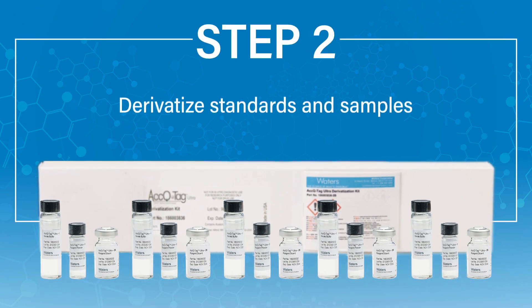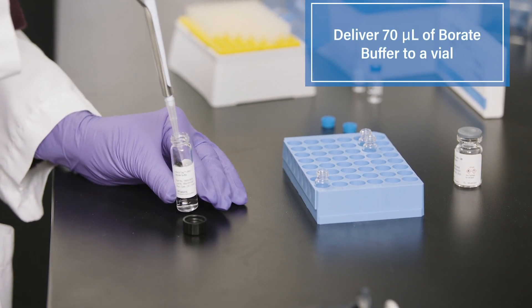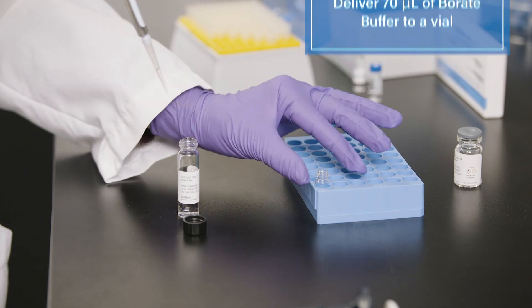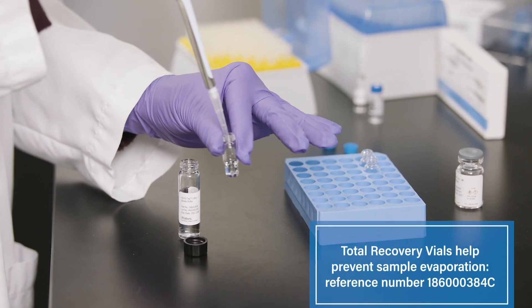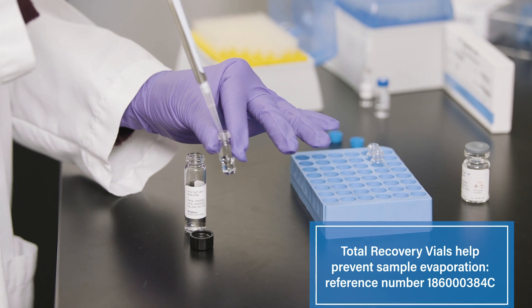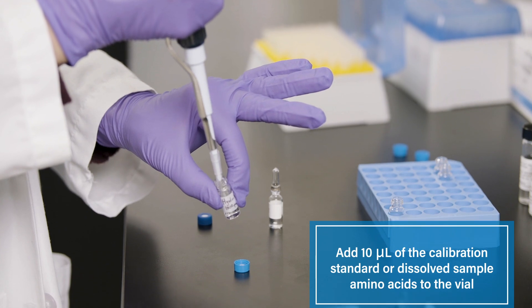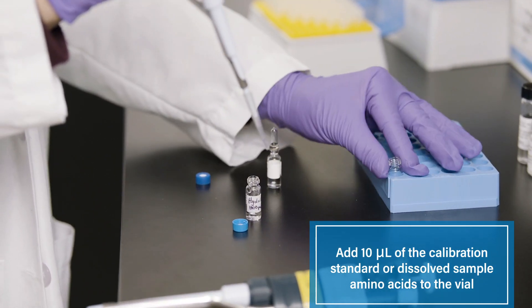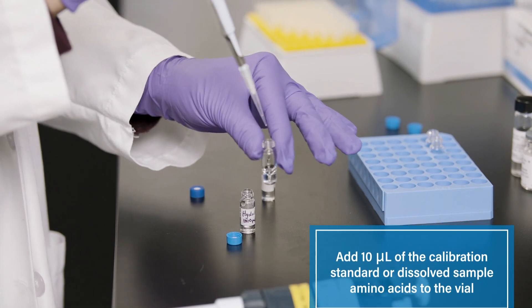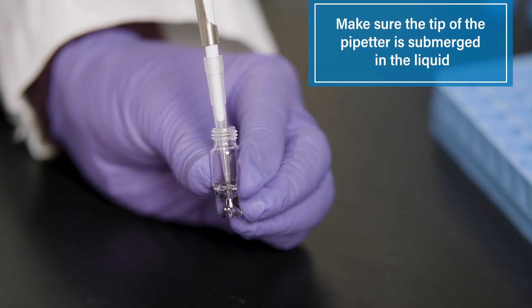Step 2: Derivatize standards and samples. First, use a micropipetter to deliver 70 microliters of borate buffer to a vial. Waters recommends the use of our total recovery vials for amino acid analysis. Next, use a micropipetter to add 10 microliters of the calibration standard or dissolved sample amino acids to the vial. Make sure the tip of the pipetter is submerged in the liquid.